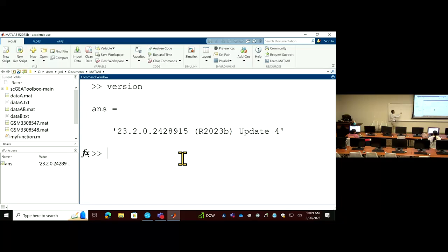So we need to find the Python version. It could be 3.11, because the current version is 3.12, which is the latest version. It was just updated last week. But maybe we need an older version in order to make this compatible; we will check their table, just to make sure they can talk to each other.